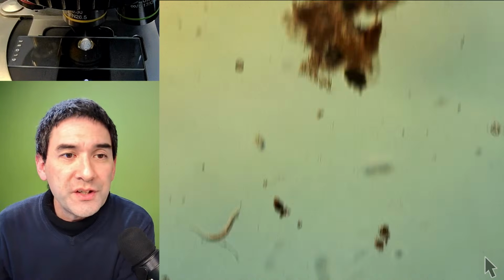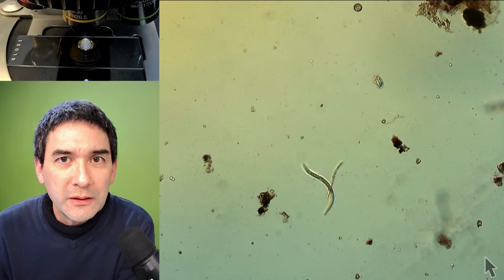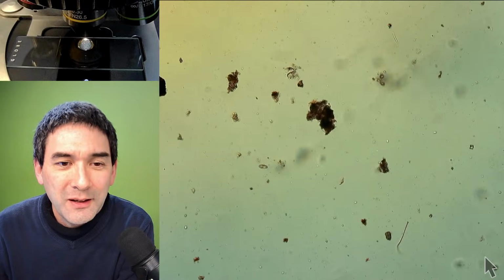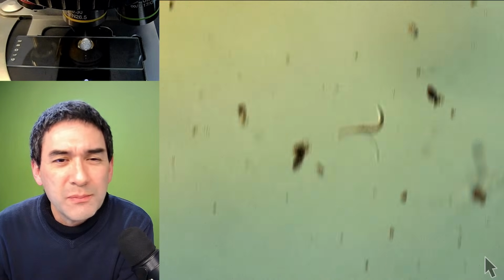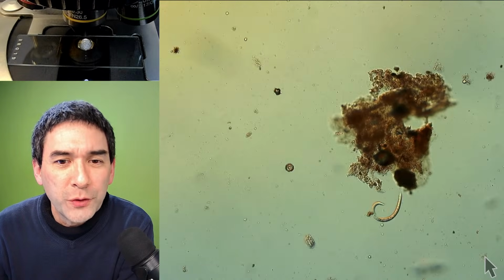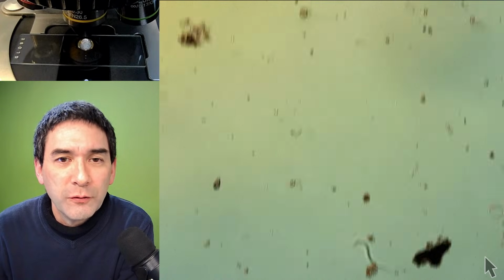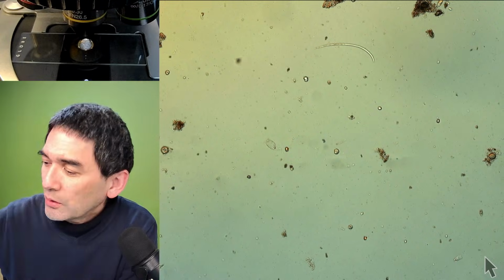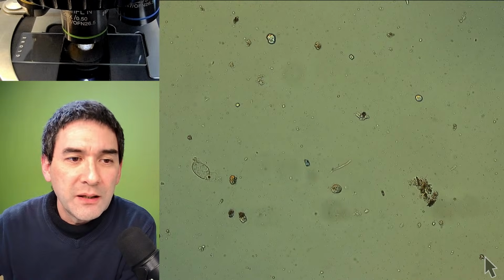I just wanted to show this to you as one of the things which I just discovered in this flower pot water, which looked pretty unappetizing. I found a couple of ciliates, mostly nematode worms. I have some rotifers. Here, plenty of worms as always. Just wanted to share that with you. Some more or less interesting ciliates, of course. That's something that I think we all like to do.